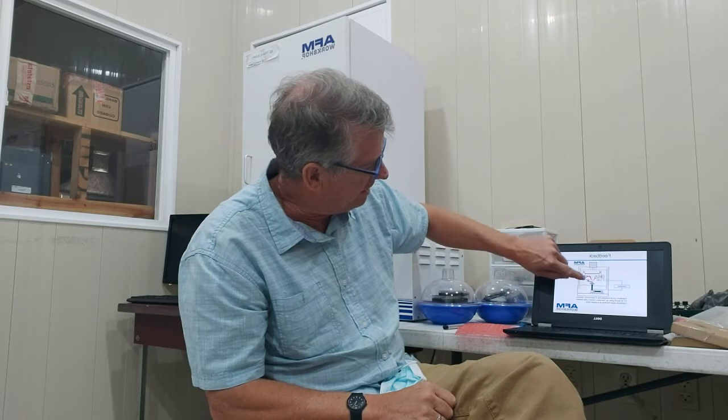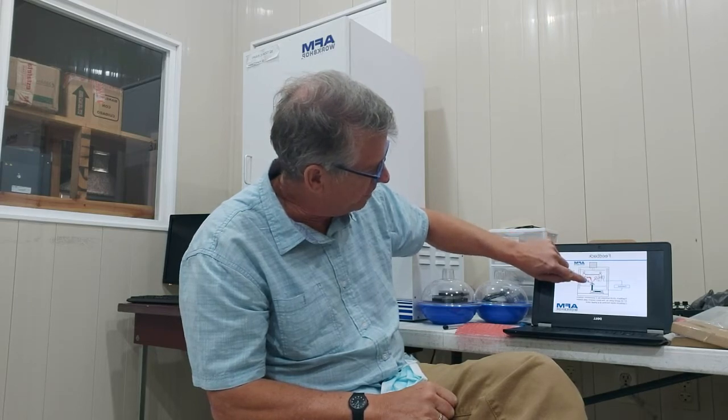So anyway, what we're going to do is we're going to take the output of that top minus bottom signal, we're going to feed it back into the Z ceramic. So that when the cantilever bends up, the ceramic will pull back. You'll see what happens here is that the cantilever bends a certain amount, and then after it bends that amount, the Z ceramic goes down. That's called the Z feedback. Basically, it takes the top minus bottom signal and feeds it back into the Z ceramic. So when the cantilever starts to bend, at a certain point, the feedback is activated and it goes down. All right, so feedback control. You got that?